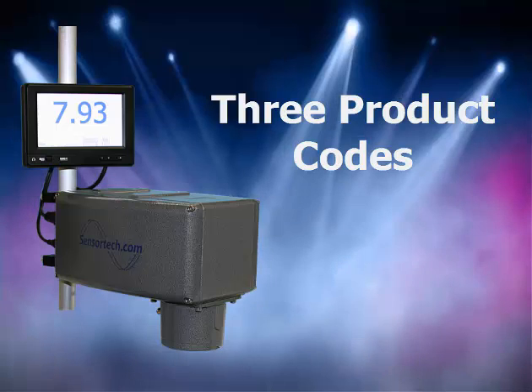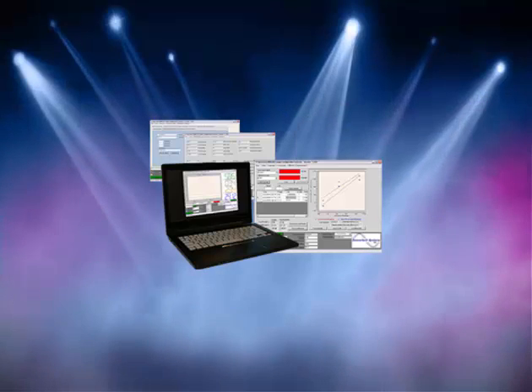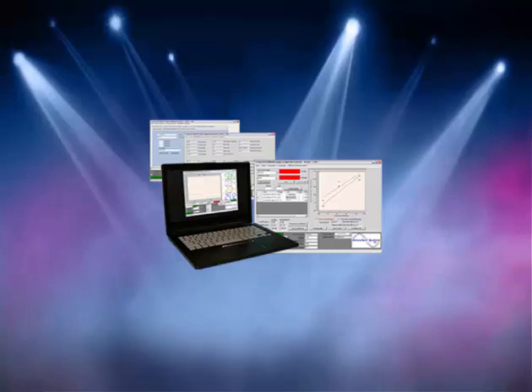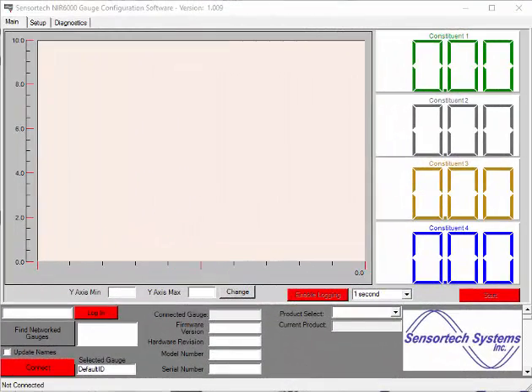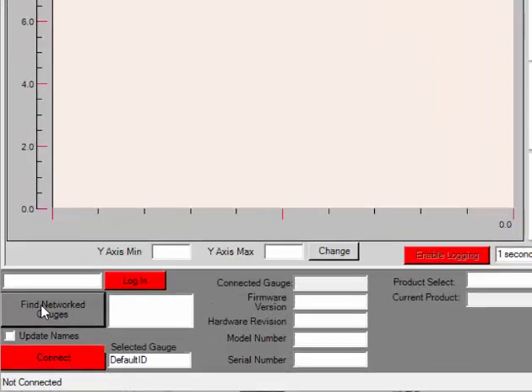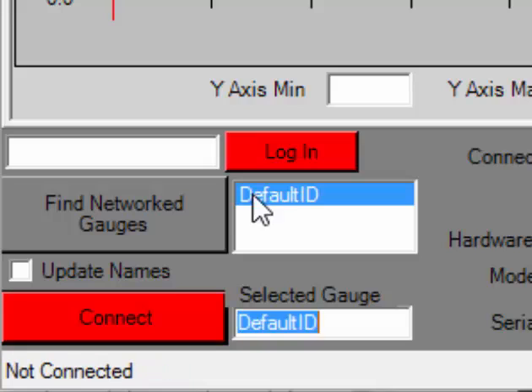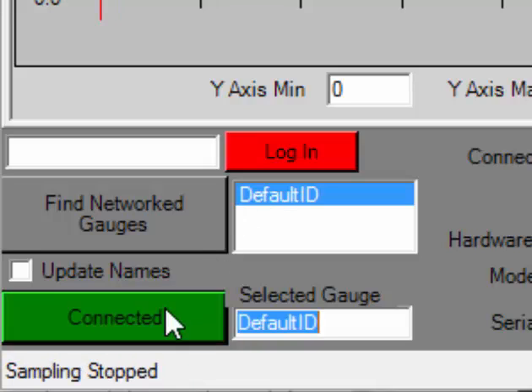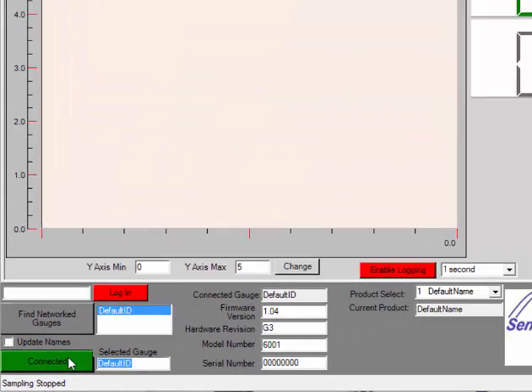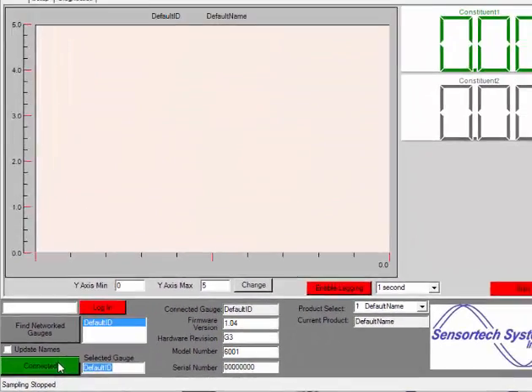Firstly, connect your NIR Analyzer to a PC or laptop with Sensortec's configuration software preloaded and start the application. Once the configuration software is running, go ahead and select the Find Network Gauges button. You will see a list of connected analyzers in the list box to the right of the Find Network Gauges button, and in this case you will see Default ID listed. Double-click Default ID in the list box and it will be displayed in the Select Gauge field. Select the red Connect button and it will turn green and display it as connected. You will see the fields to the right filled in, indicating that the analyzer is connected to the application.